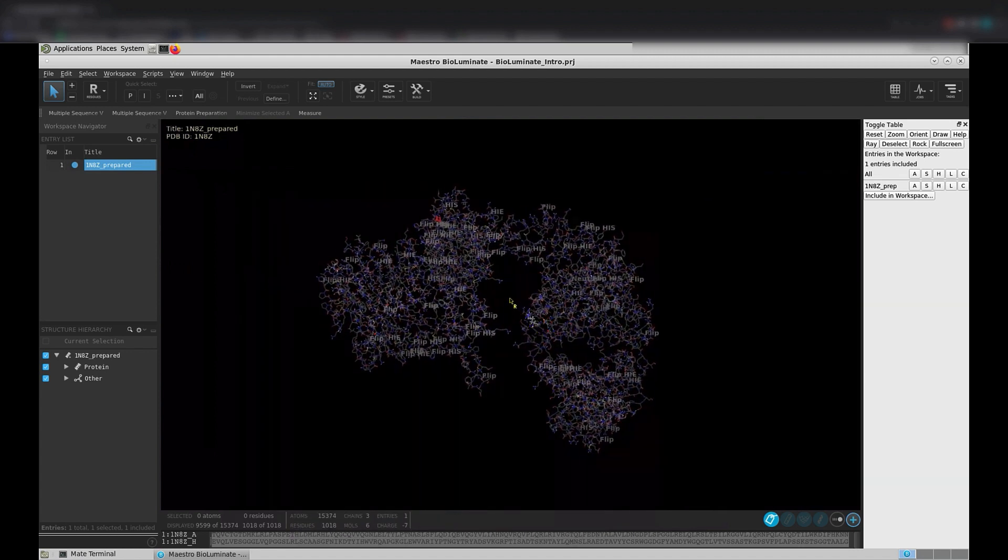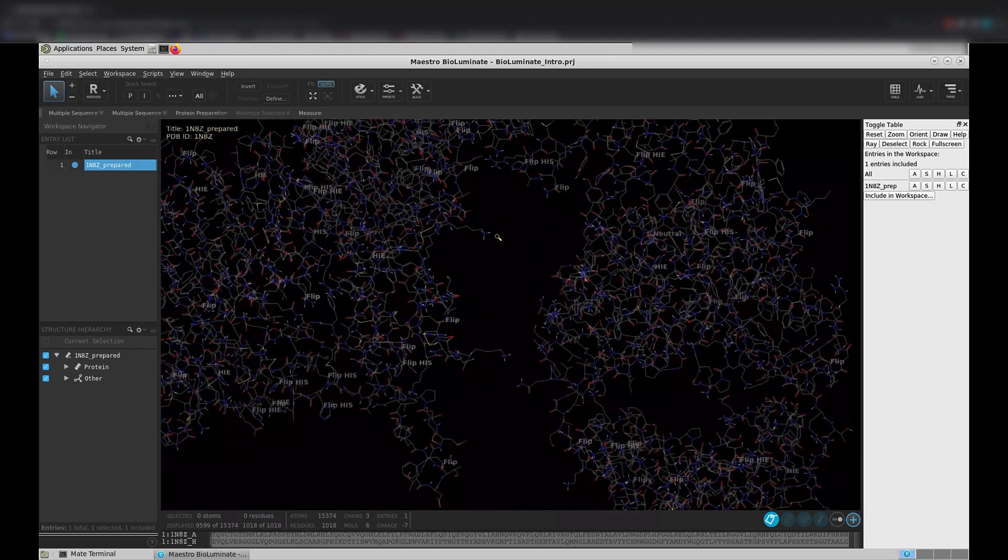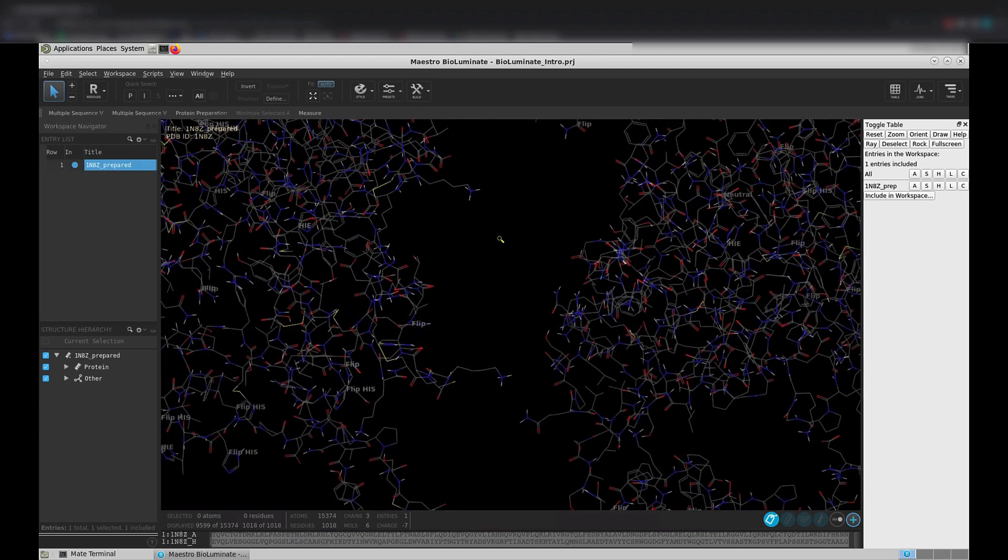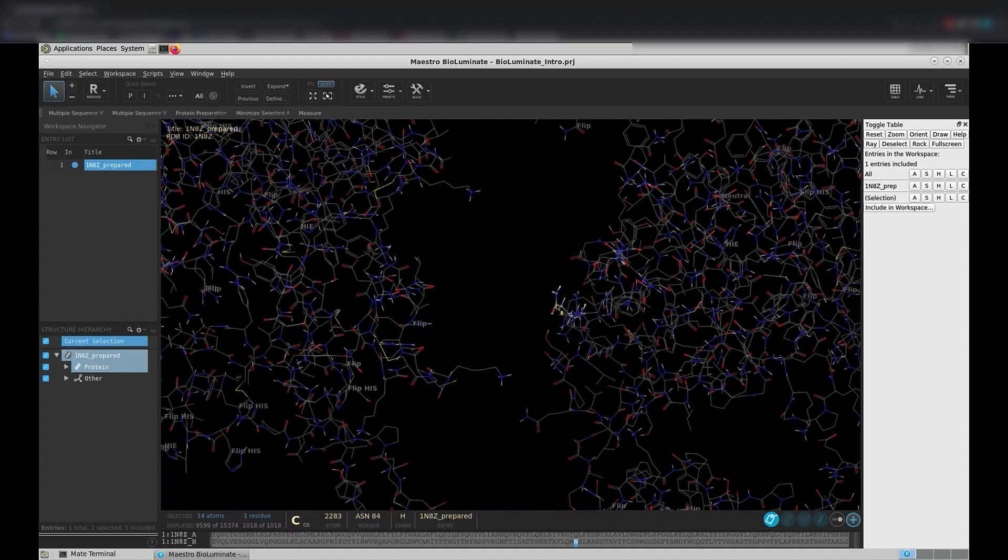Finally, let's zoom in a bit to see the individual residues of the structure more clearly. Use your left mouse button to click on some part of your structure. This will select the particular residue that your mouse clicked.